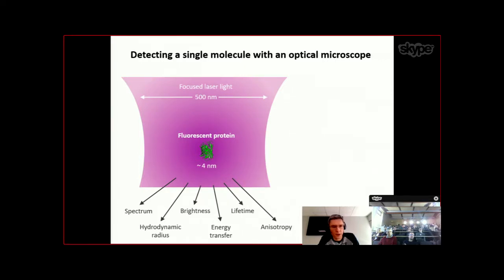You also gained a lot from filters, okay? Dichroic filters, extremely flat, sharp edges, bandpass filters, extremely high rejection, so you can cancel out almost all the backscattered light from the laser and Raman scattering from the solvent. So you gained a lot from this technology.